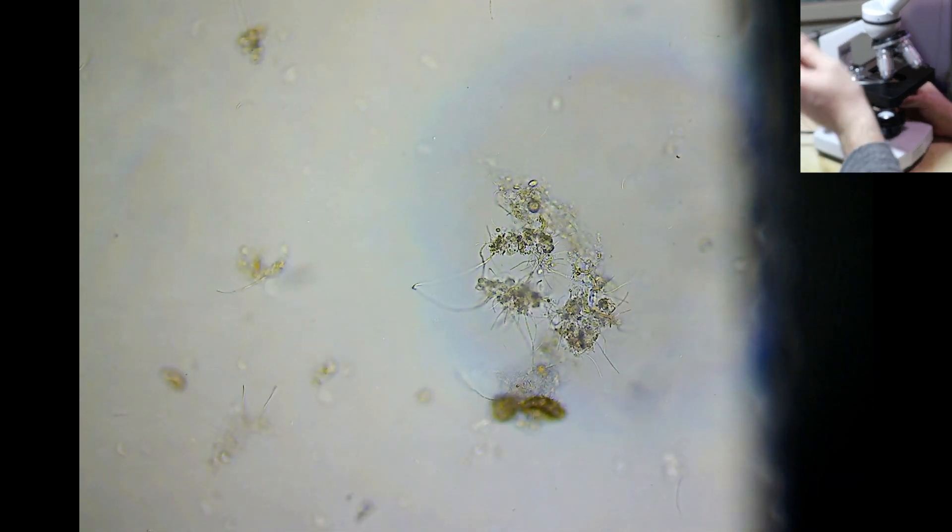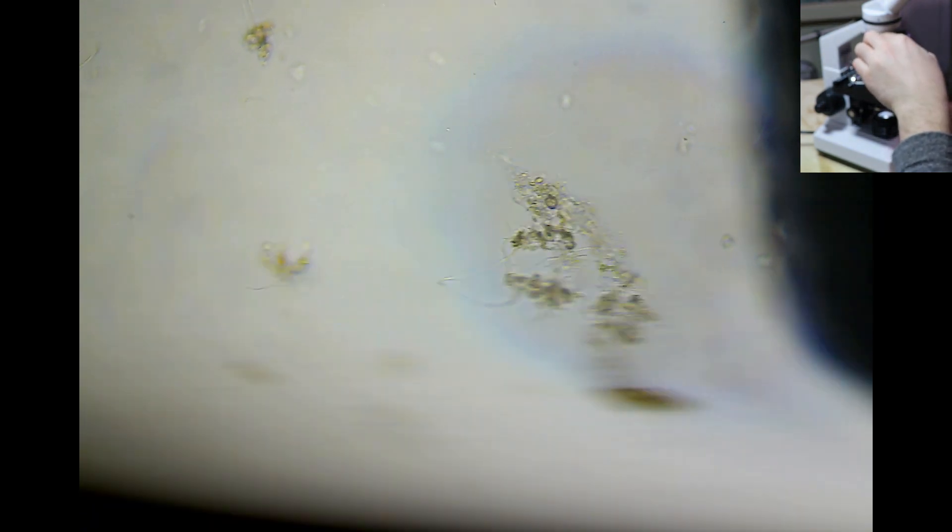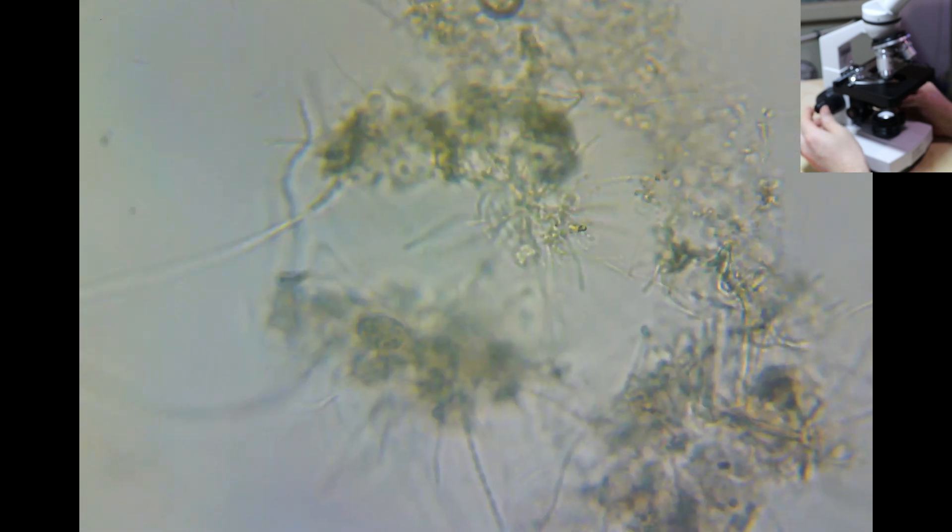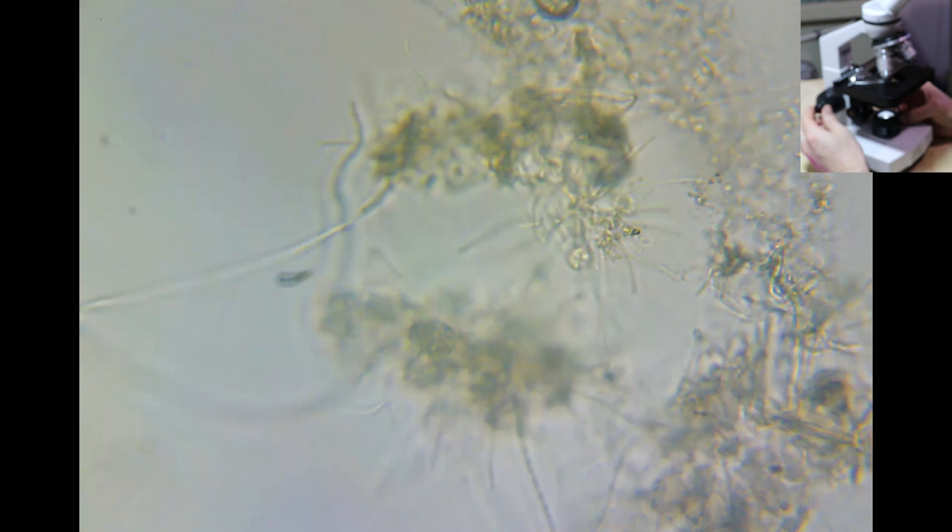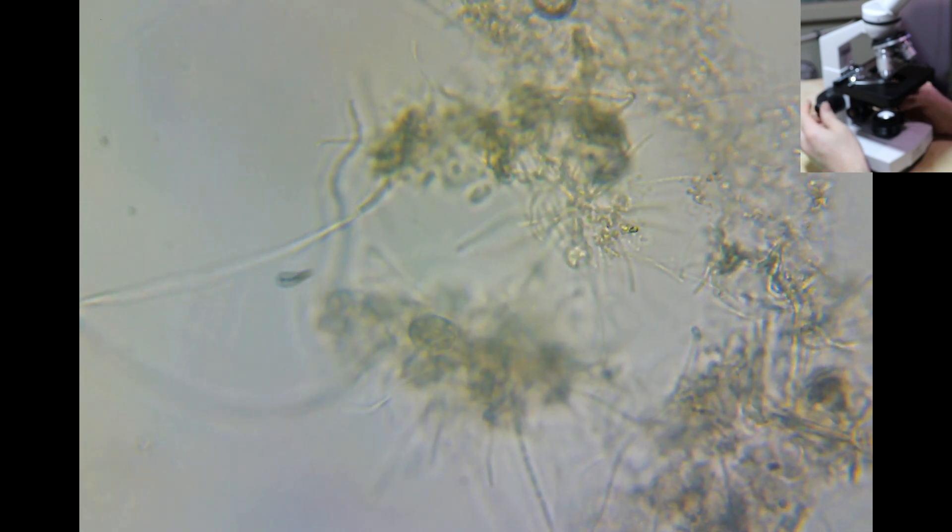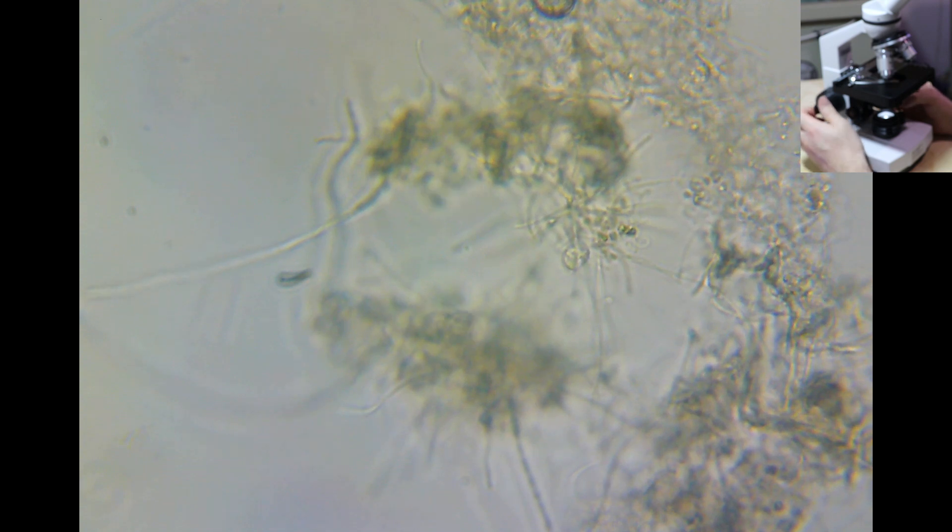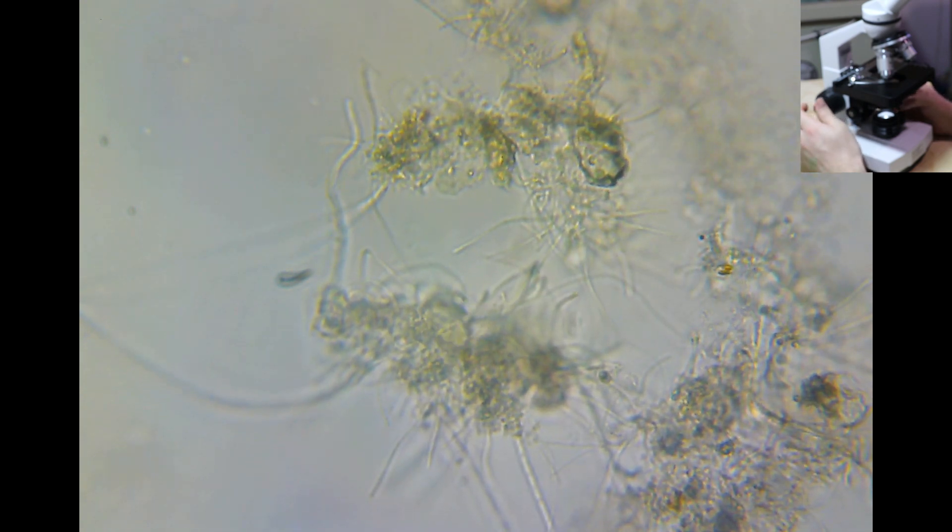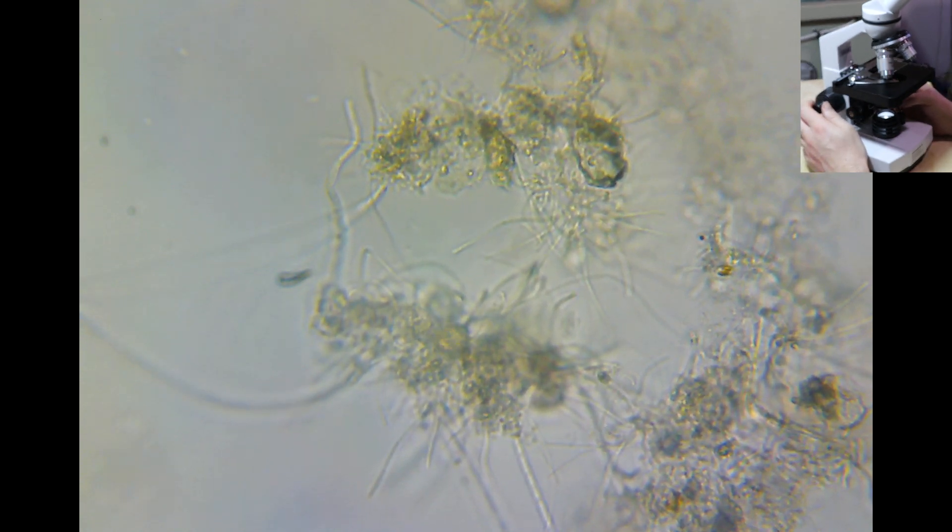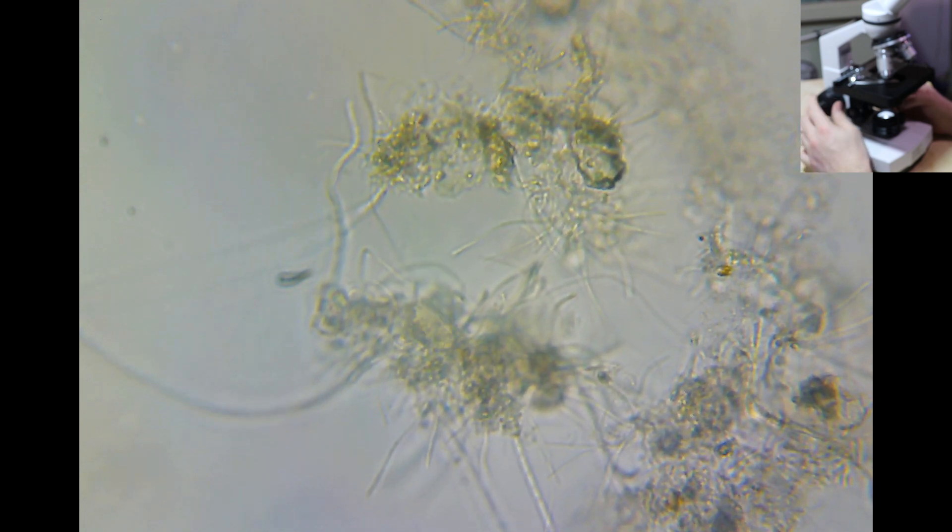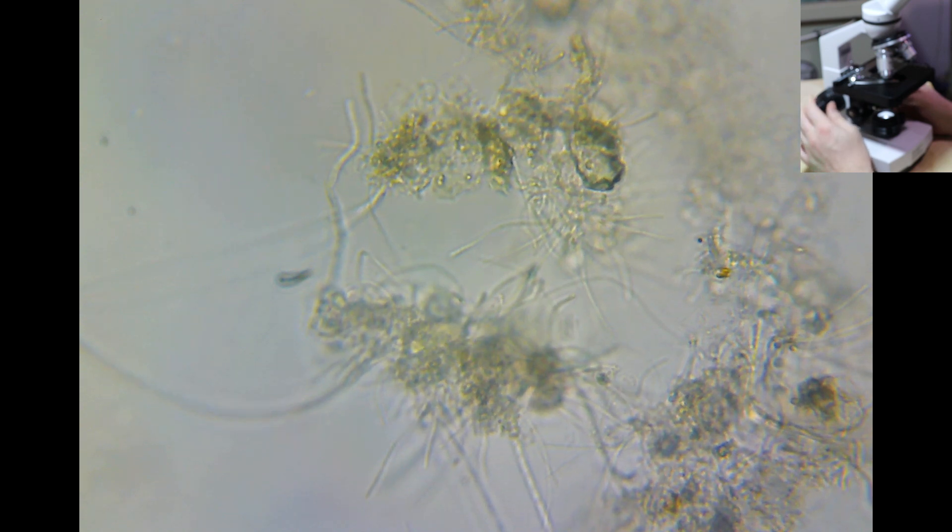There's actually something in the middle of that stuff there that's really small. That's a really good thing to find. I'm just going to move to 400 times. Like I said, I don't usually use 400 times. Let me brighten it up. You can see the little dots a little bit better moving about. That thing there that's moving about is actually really small and probably comparable in size to something like Costia. So the smallest thing that you would find on a fish. It's quite a good thing to be able to see quite easily. Let's move back to 100 times and get back to you if I find anything.